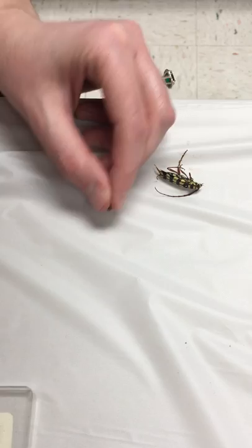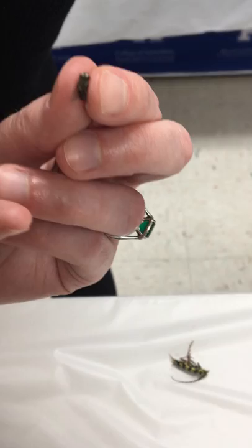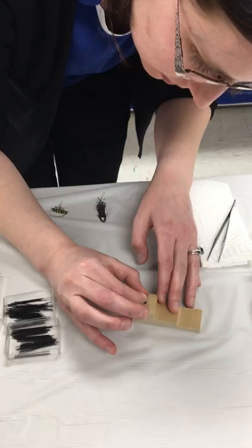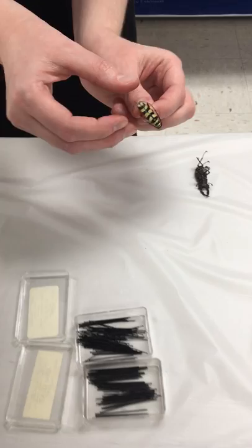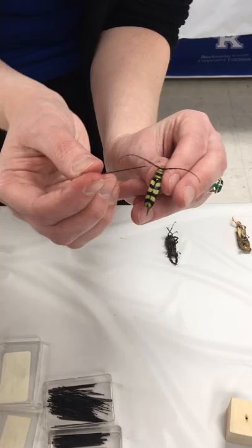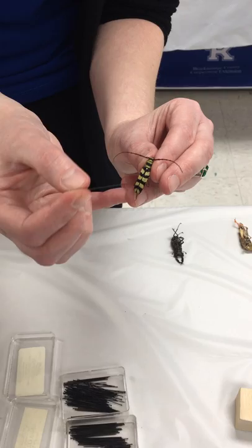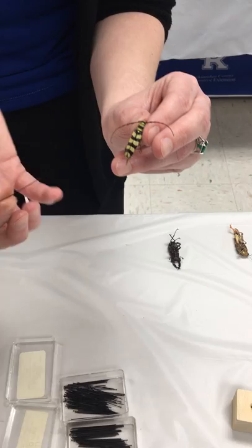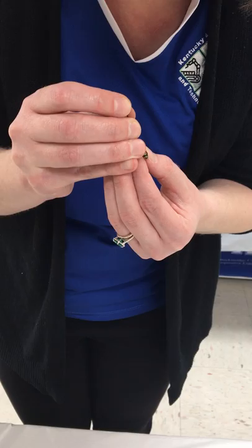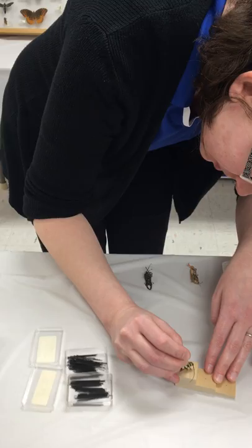Here's a tachinid fly — a parasitoid, a good fly to see in your garden. I'm going to pin it a little to the right through the thorax where the wings are attached. Next is a longhorn beetle. With beetles you'll aim for the elytra — those hard front wings covering the membranous flight wings — and actually pin through the right elytra, again a little off-center. I'll use the pinning block to get it at the right height and fix the antenna in a minute.